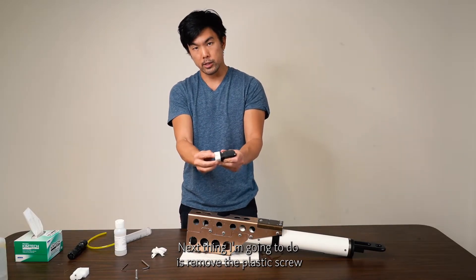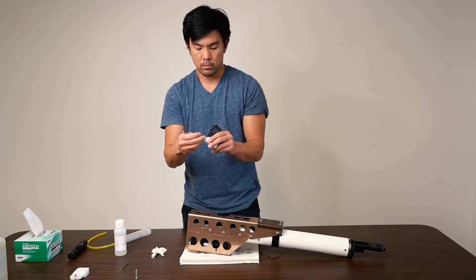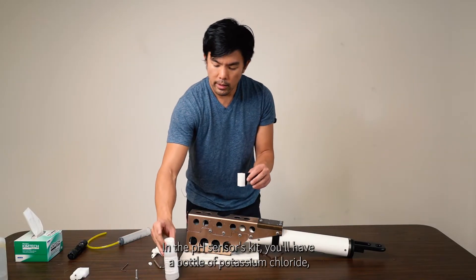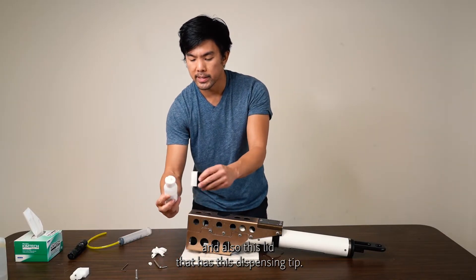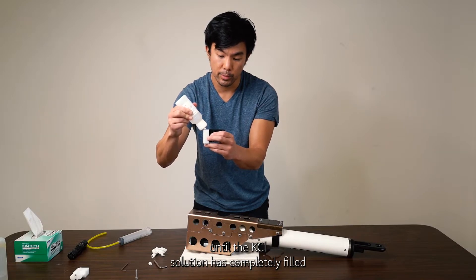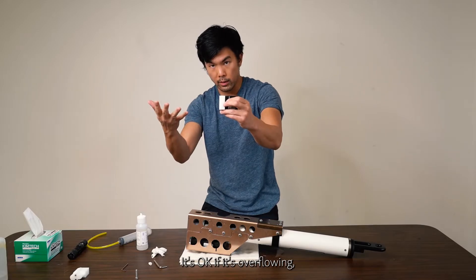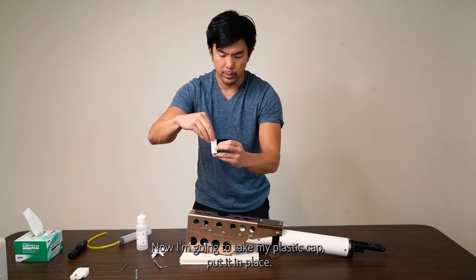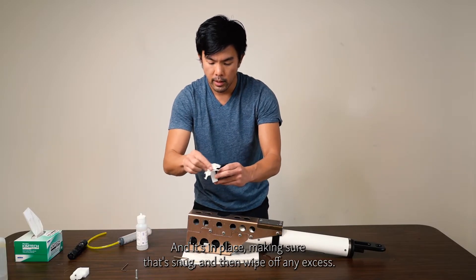Next, remove the plastic screw from the soaker block and fill it with potassium chloride solution. In the pH sensor's kit, you'll have a bottle of potassium chloride and a lid with a dispensing tip. Pour it in until the potassium chloride solution has completely filled the soaker block — you can pour until you see a bubble on top. It's okay if it's overflowing. Then take the plastic cap, put it in place to displace any extra potassium chloride, screw it snug, and wipe off any excess.